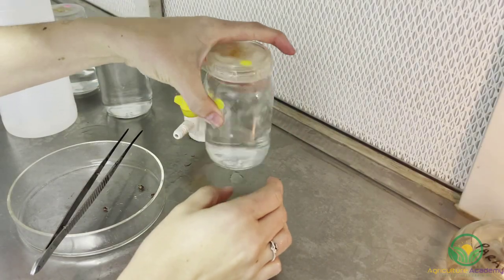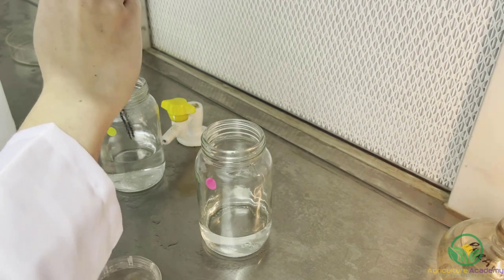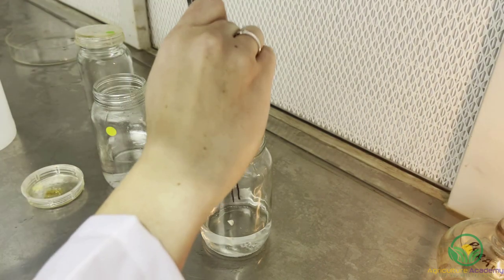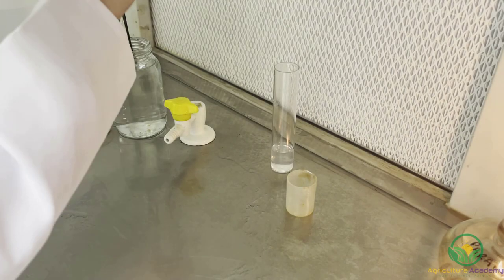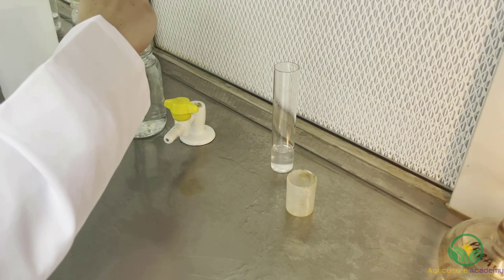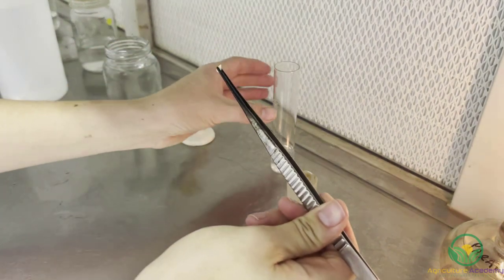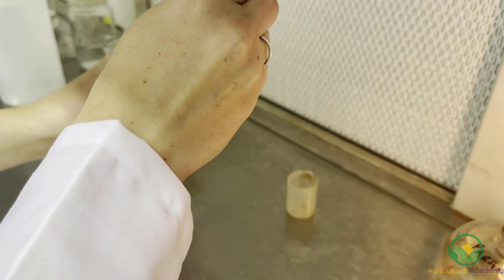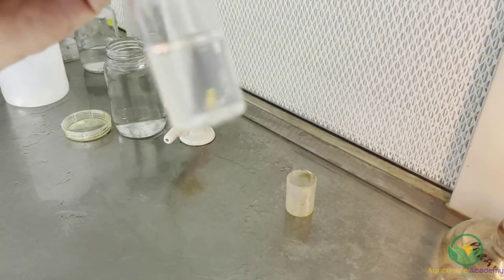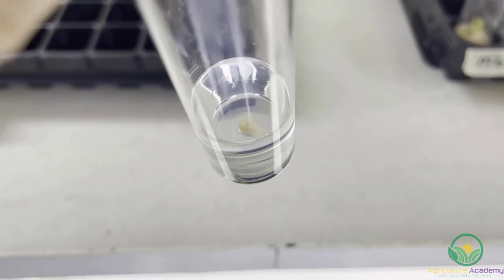The seeds will then undergo their first round of sterilization, spending 10 minutes in bleach. After this, they are transferred to the ethanol solution for 10 minutes. Lastly, the seeds will be washed in distilled, sterile water. After they have been dissected, the embryos are placed into the test tubes.